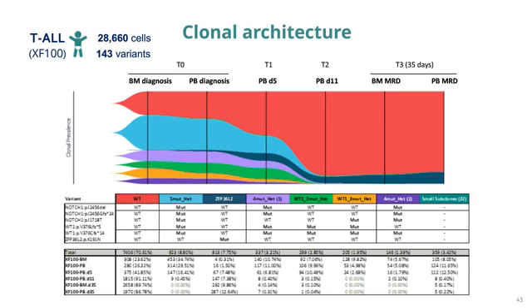These clones are also eradicated at minimal residual disease, but you can see that for one of them, this dark blue, it is not only not completely eradicated, but it seems that it's even expanding. So now this is worrying, and we can really detect this clone early on. If you look at time 0, this clone was already detected at a very small frequency, about 1% of the cells, both in blood and in the bone marrow.